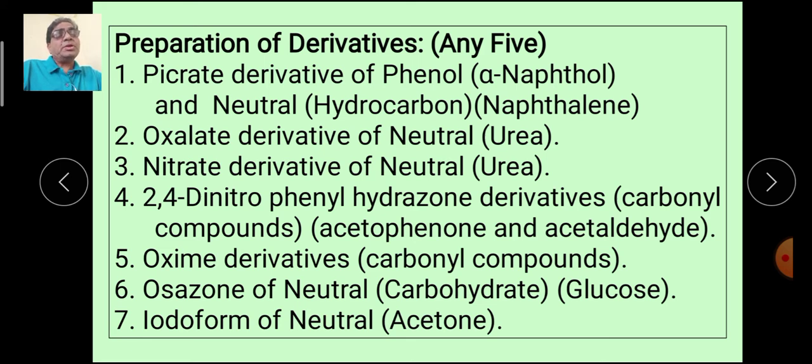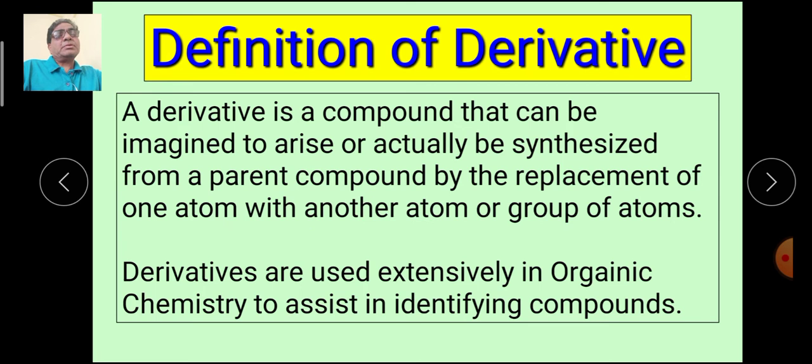Out of these we are going to prepare 5 derivatives. Okay. Now the definition of derivative. What is a derivative?